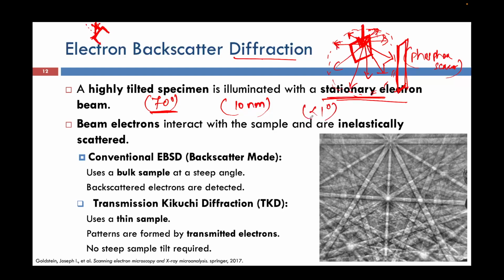That is why electron backscatter diffraction will give me very good results. Though I am using the same backscattered electrons for extracting results, the resolution will be much higher than what I would otherwise have got from a backscatter detector. Here I am getting the information using diffraction.